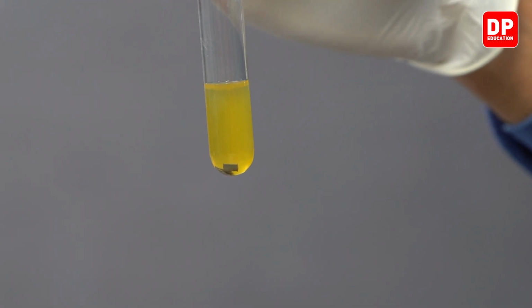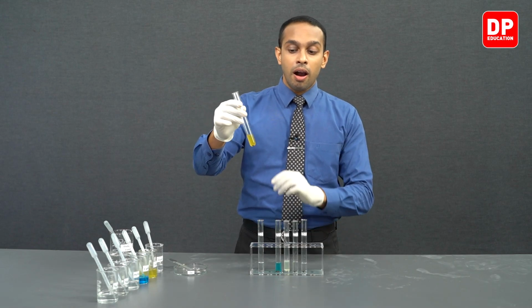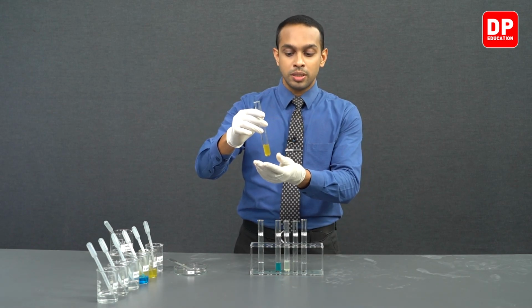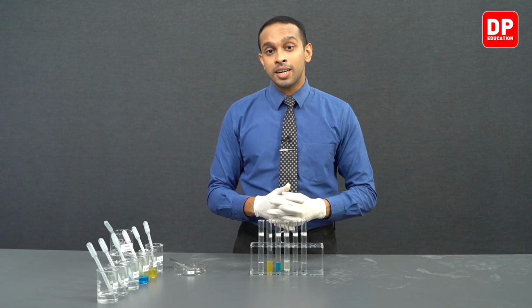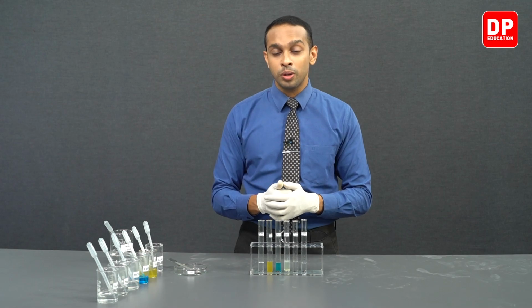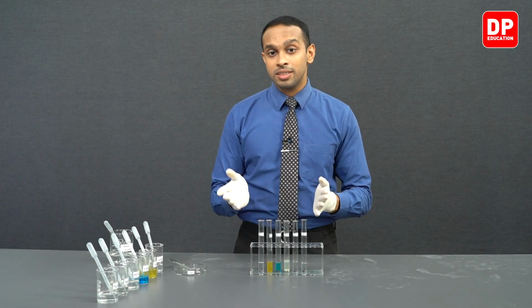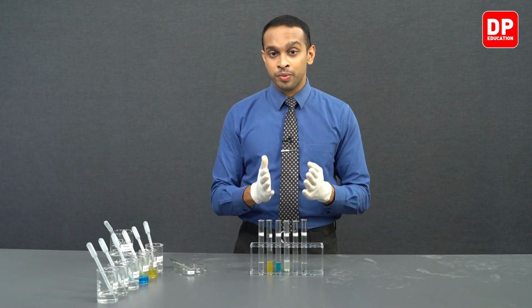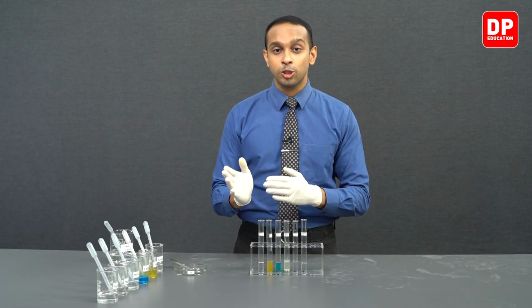Zinc solid will get oxidized to form Zn2+ ions, whereas Fe2+ gets reduced to form Fe solid. So here, students, iron solid particles are formed and dispersed around the medium. The iron particles formed are quite small, and since the reaction rate is quite low, you wouldn't necessarily observe a large amount of iron solid, but zinc definitely reacts with Fe2+ aqueous ions and displaces Fe2+ as iron solid.